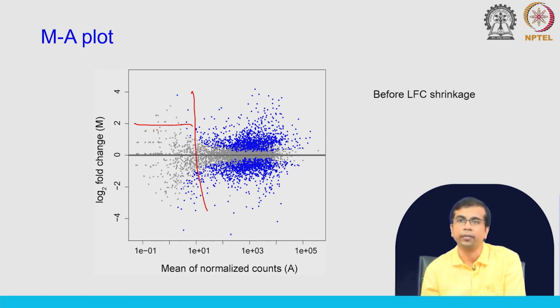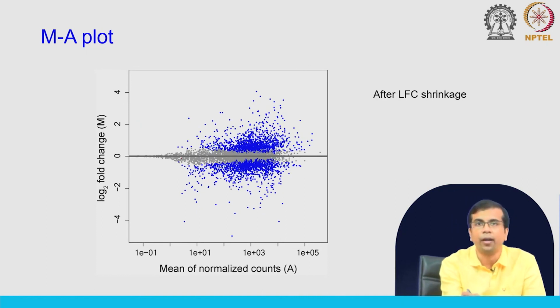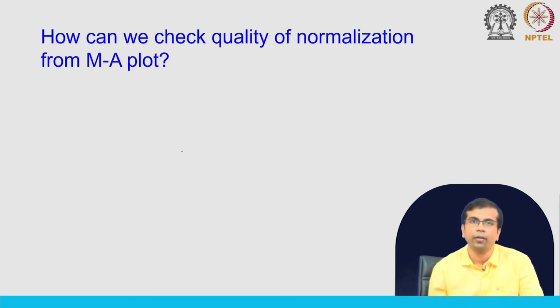It uses an empirical-based method to shrink these values. Okay, and you see that these values have been shrunk and are now close to 0, right. This makes the method very robust, because we take this variability into account depending on the number of replicates.